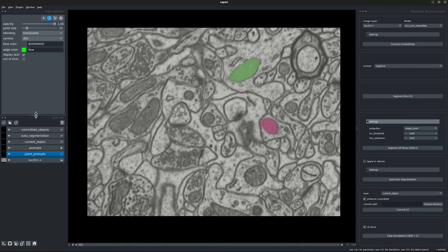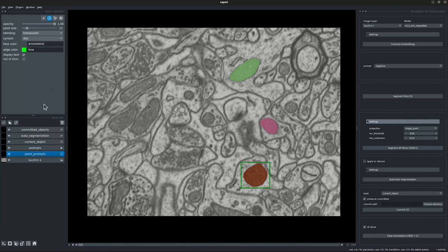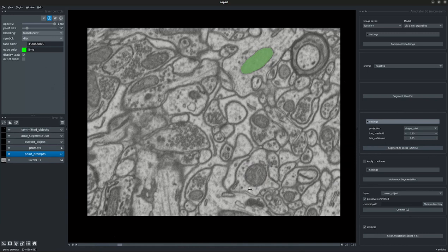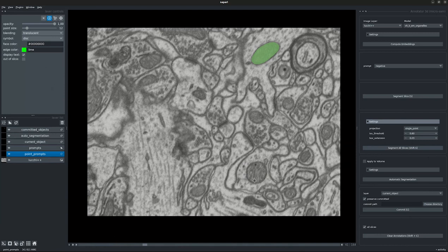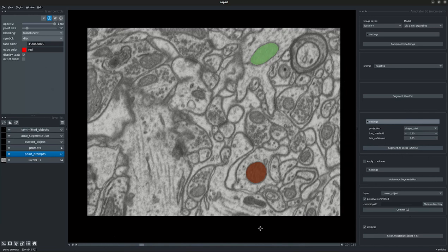Let's try the similar behavior of stopping at a particular slice using box prompts. We start with the box prompt, and then place a negative point prompt at a desired slice, then segment all the slices. We see that the segmentation has happened along all the slices and stopped at our desired spot. Let's go ahead and commit this.